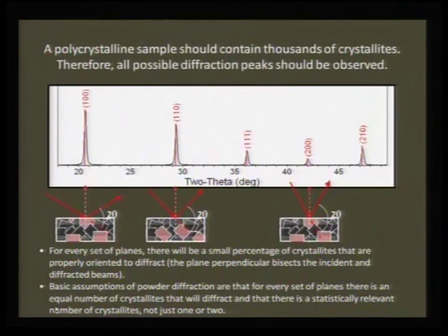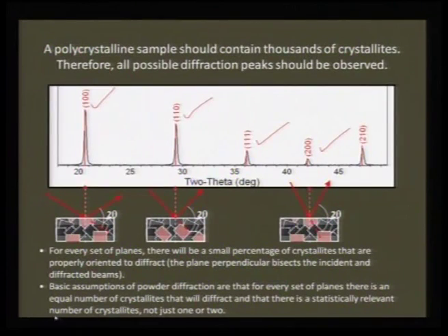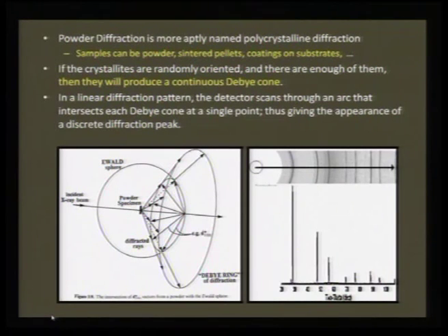Now, if you look at polycrystals, for example, in polycrystalline patterns you would get all the reflections, 100, and as you see here 110, 111, 200, all the peaks of different crystal planes are present, which you can get in a polycrystalline sample as against a single crystal. So, in a single crystal, you would get only a preferred Miller indices reflection, whereas in a polycrystalline sample, you will get all the patterns emerging in the picture. Now, in the earlier days, before we got this XY recorder, or as you see in the present generation, everything is appearing on a computer screen.